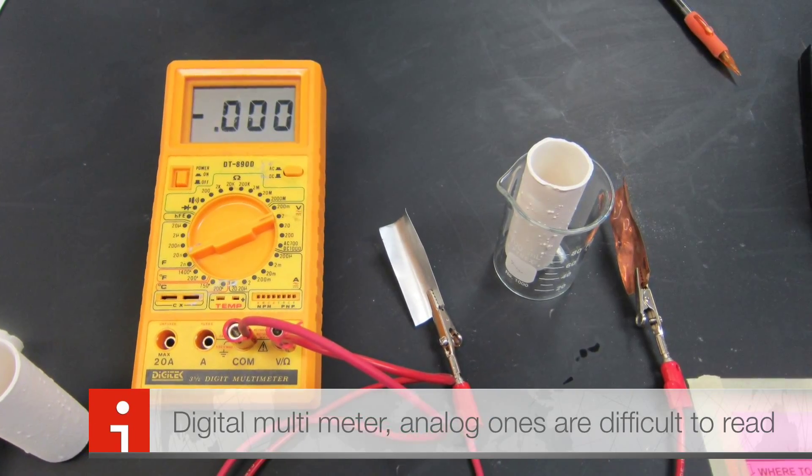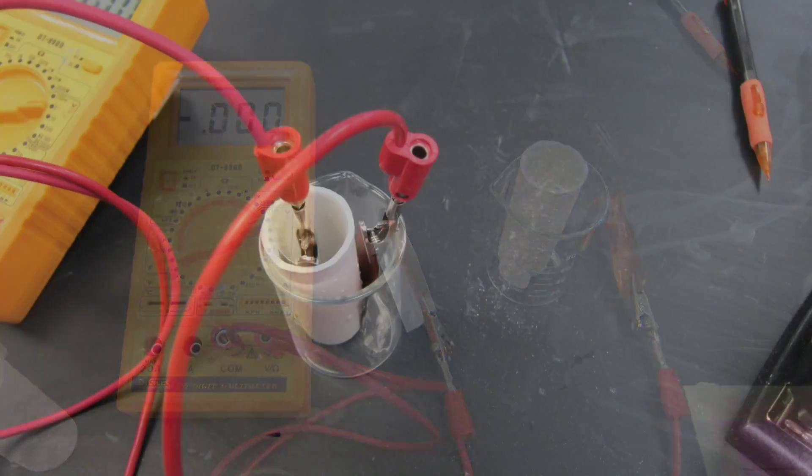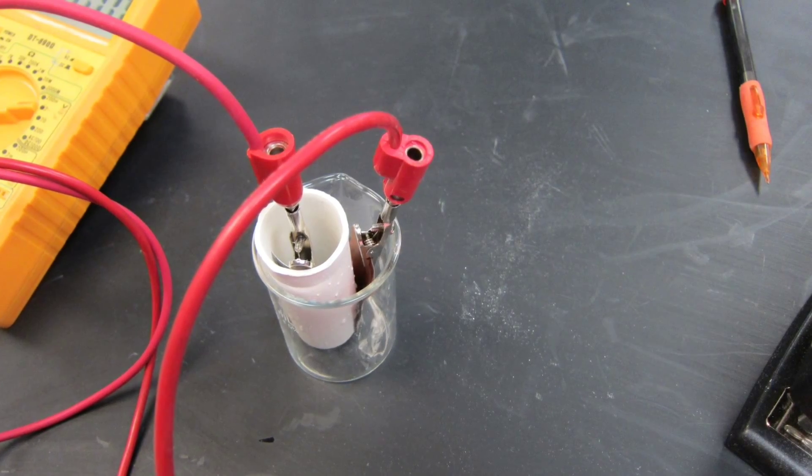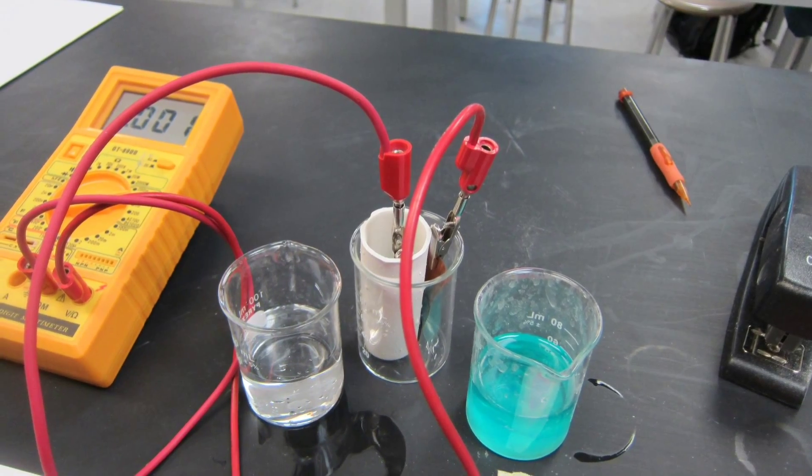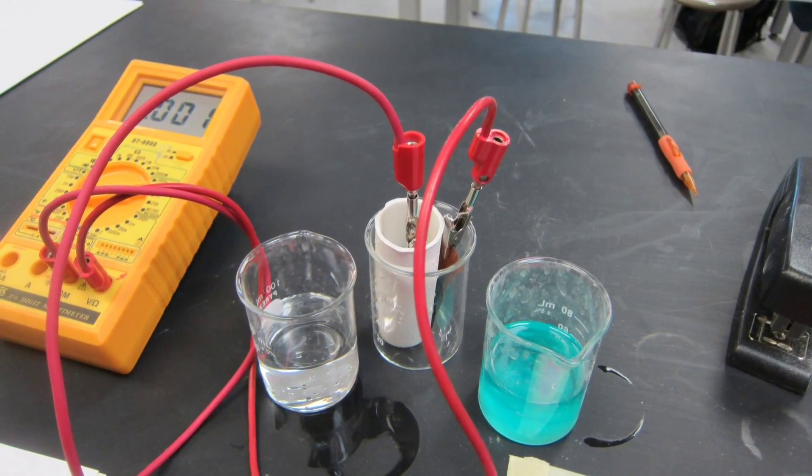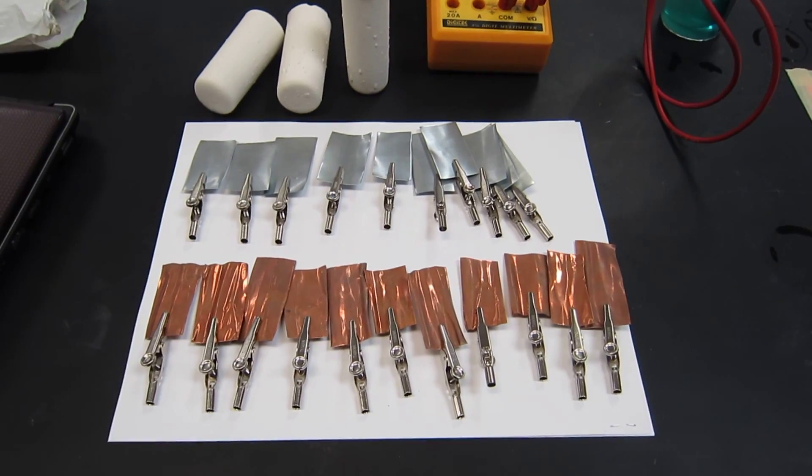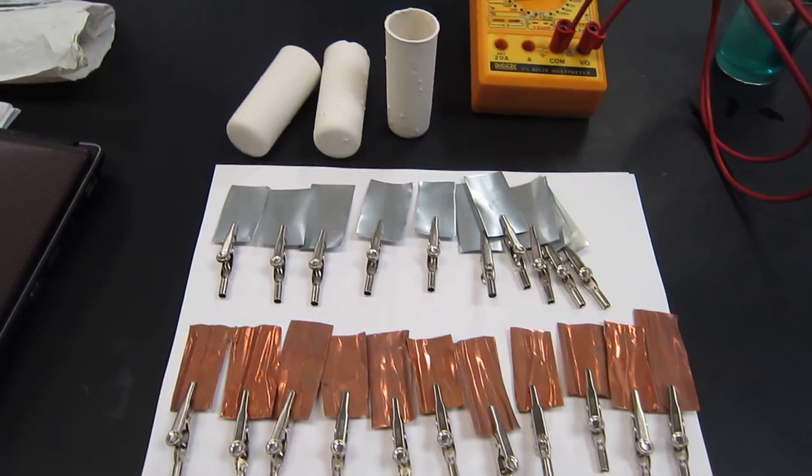In order to measure the EMF of the cell, we will use a digital multimeter. Connect the electrodes to the multimeter. The anode is zinc and the cathode is copper. This is how the setup will look once you have connected all the devices.